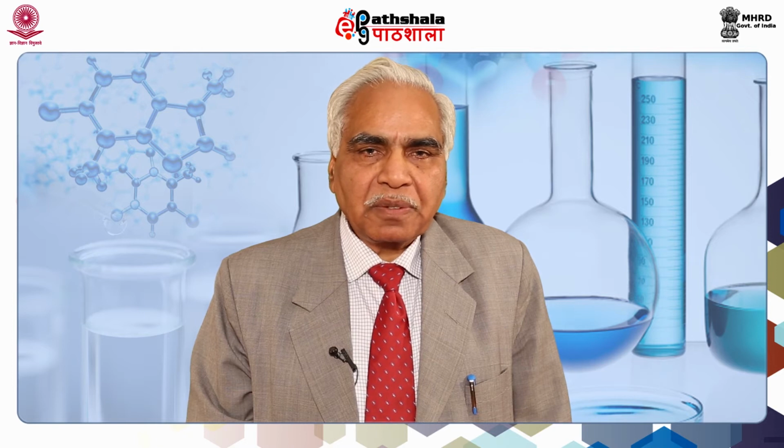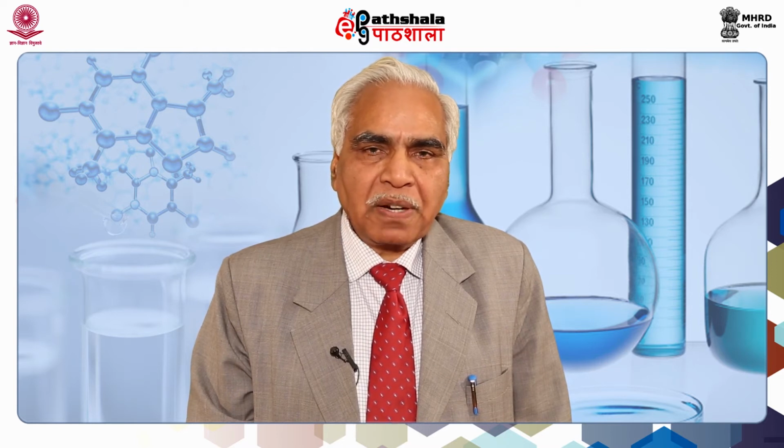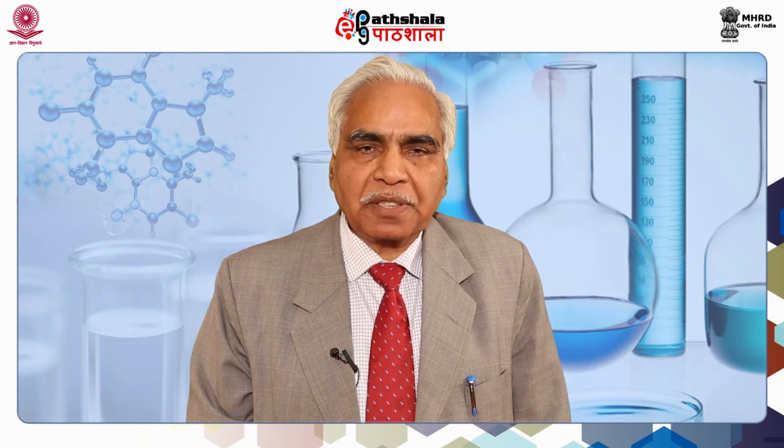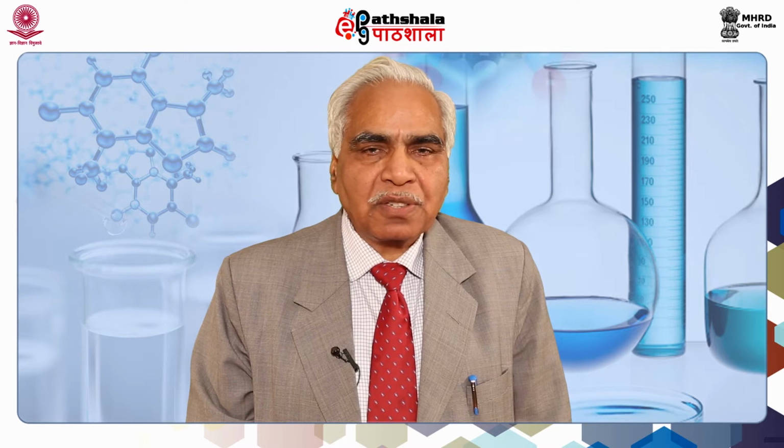These include the separation time is only in minutes, whereas other electrophoretic techniques take hours. The resolution power is very high. That is, if sample is applied in low volume, this is of course true for this particular technique, and that's why the sensitivity is very high. Resolution combined with sensitivity is the unique feature of this capillary gel electrophoresis.